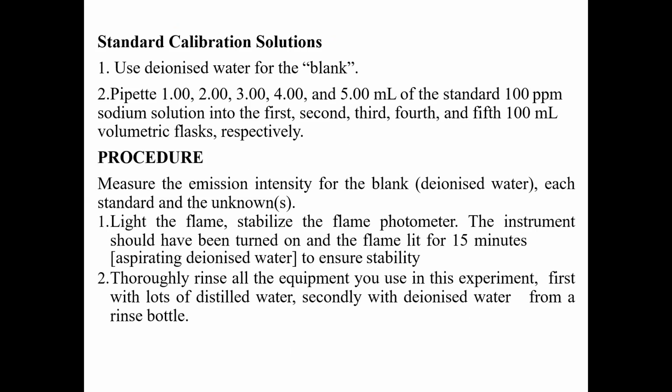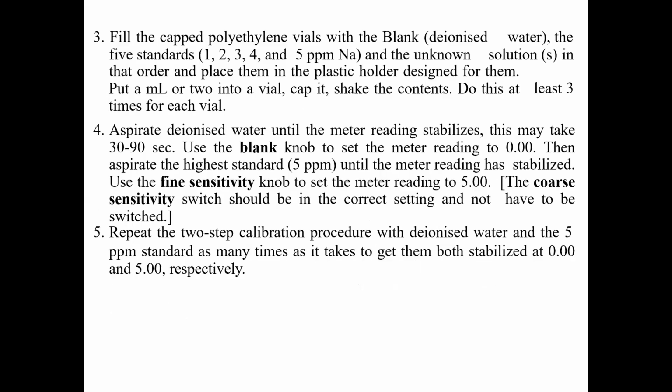Then thoroughly rinse all the equipment you use in this experiment. First, lots of distilled water, and secondly, deionized water. Fill the capped polyethylene vials with the blank, 5 standards, and unknown solutions, and place them in the plastic holder designed for them. Then put a solution into a vial, cap it, and shake the contents; do this at least 3 times for each vial. Then aspirate the deionized water until the meter reading stabilizes.